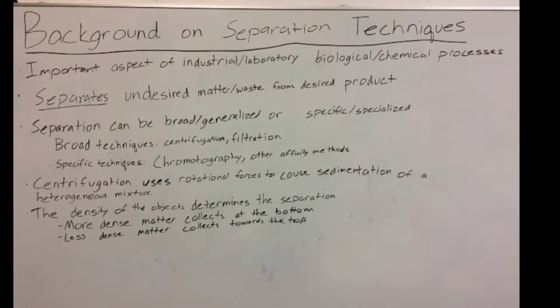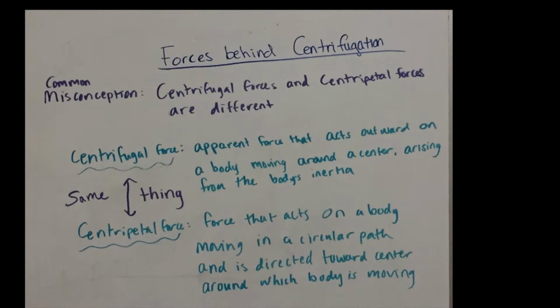More on this later. A common misconception about the forces behind centrifugation is that centrifugal force and centripetal force are separate, but they're actually the same force, as you can see by the definition on the board. The rate of sedimentation in the process of centrifugation is based on the mass of the particle, which includes the density and the volume, the density of the medium, the shape of the particle, and friction.